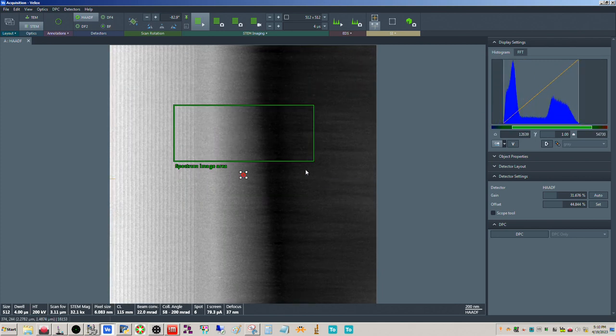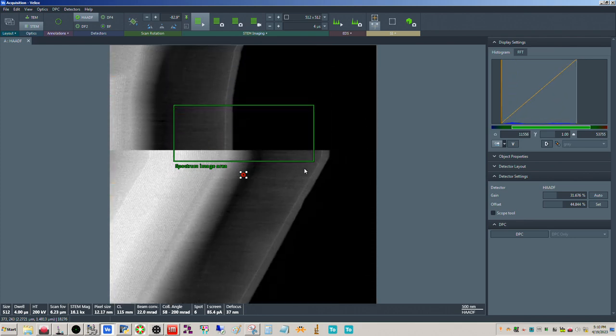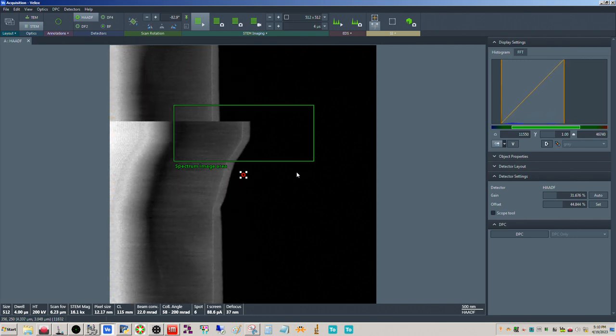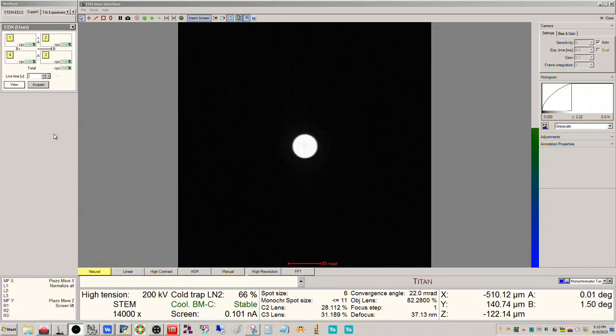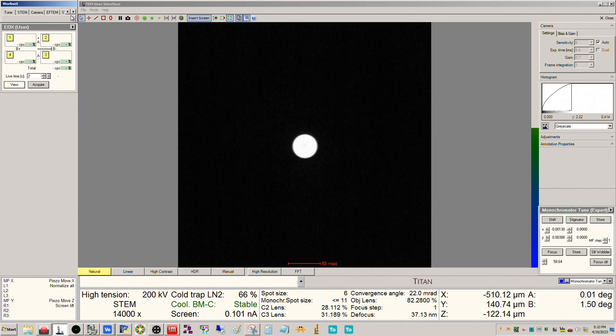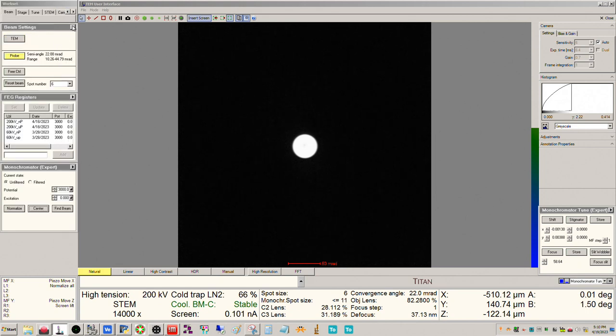Okay, so one thing we can do is switch up our microscope here, and we can do EDS mapping in STEM microprobe mode. So we'll go over vacuum. We'll pause this. Okay, so it automatically closed these anyway. Normally you want to close it manually. But what we're going to do now is go back to the beam tab, sorry, not the STEM tab, expand the panel, click free control, and then we can switch from nanoprobe to microprobe.